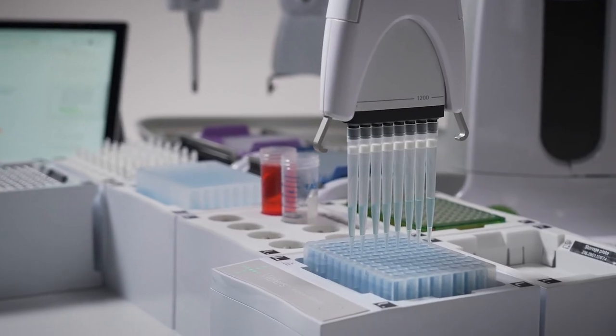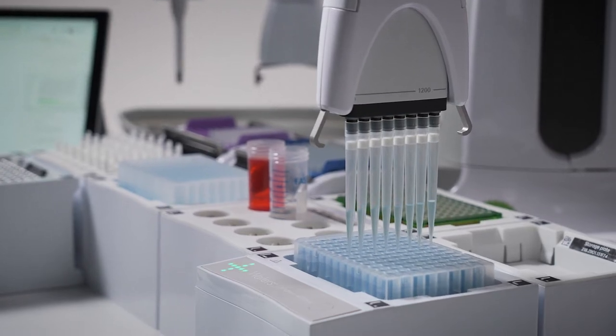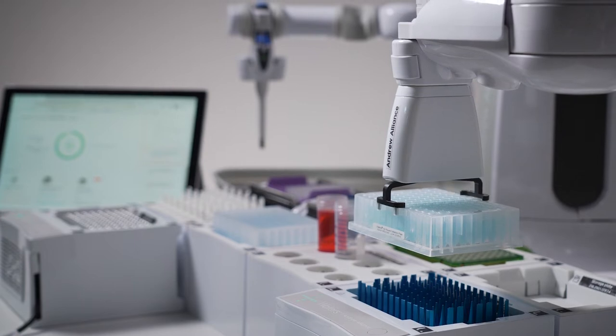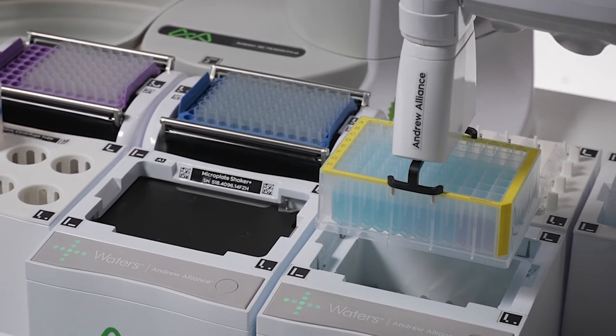Manipulating beads is a very common task, but have you thought of executing your reactions by homogenizing and heating simultaneously? As it turns out, not only does this combination improve bead binding, but it also reduces the time needed for that reaction. Finding the best labware for these bead-based workflows is important to make sure there is no sample loss and that you're getting the right yields.